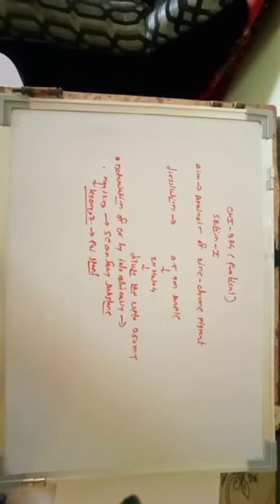This part is the standardization of Na2S2O3 using potassium dichromate. Then the solution is used for the main titration for determination of chromium iodometrically.